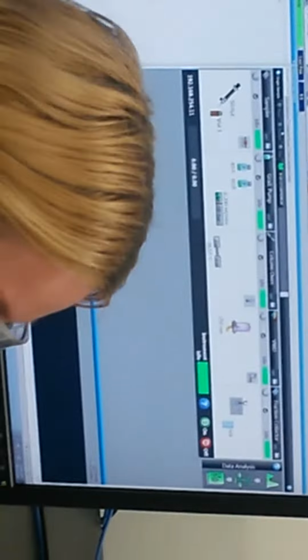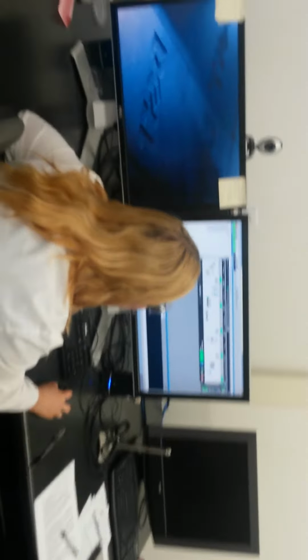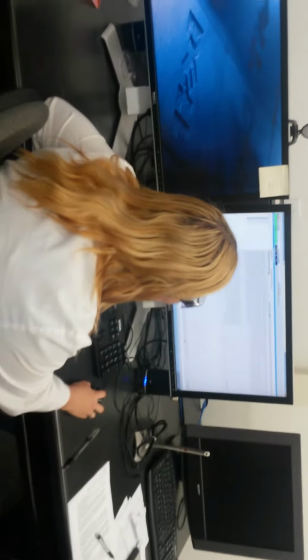The only thing you're going to do different than I think you guys did last semester is you're going to go into easy sequence, load the caffeine D sequence, and I'm going to change it for you right here so that it says 3. And it's going to load them here.